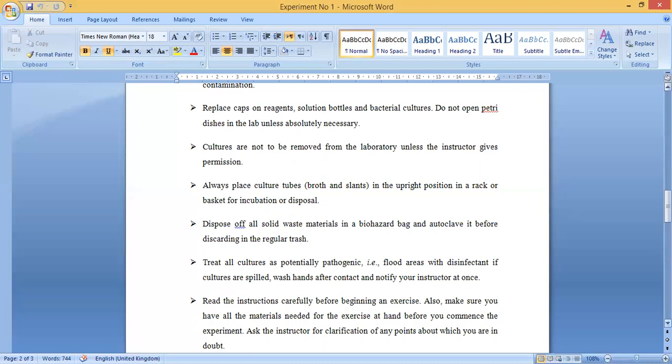Dispose of all solid waste material in a biohazard bag and autoclave it before discarding in regular trash. If the material is dangerous, it must first be sterilized in an autoclave, then placed in the regular trash so that the environment does not get infected. Treat all cultures as potentially pathogenic — flood areas with a disinfectant if cultures are spilled, wash your hands after contact, and notify your instructor.